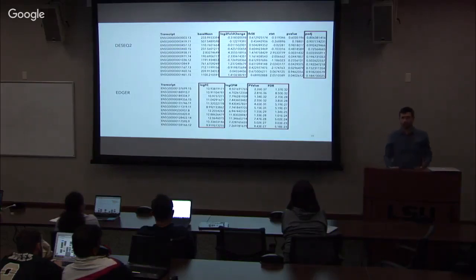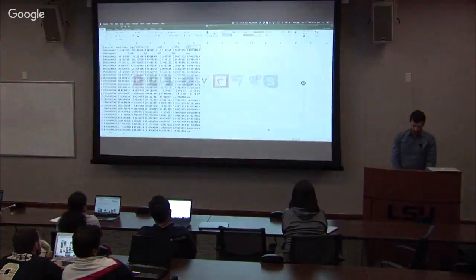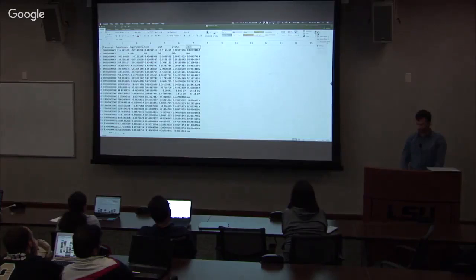So now that we have this table, how do we actually select those genes that are differentially expressed from this table? For example, we can use the p-adjusted value first, and we can filter for everything that is less than. Okay, so the problem here is that you have these NAs, right?